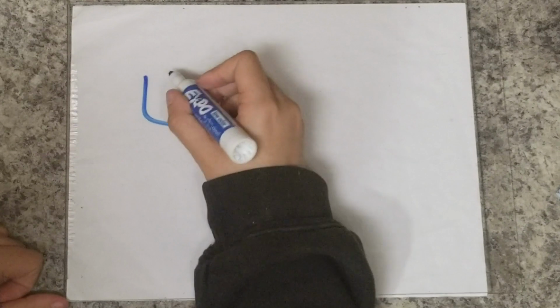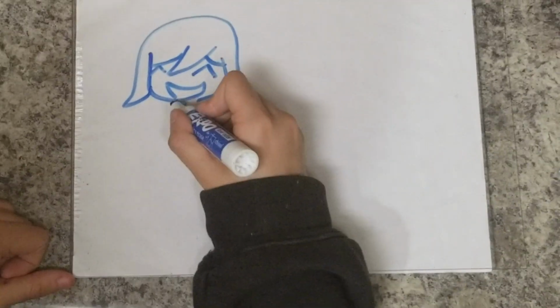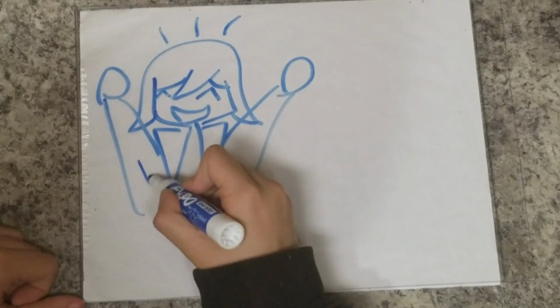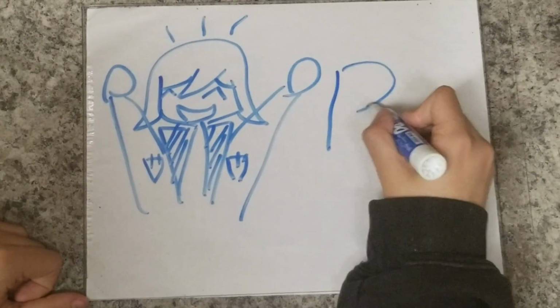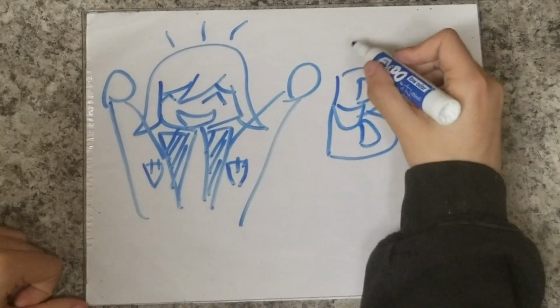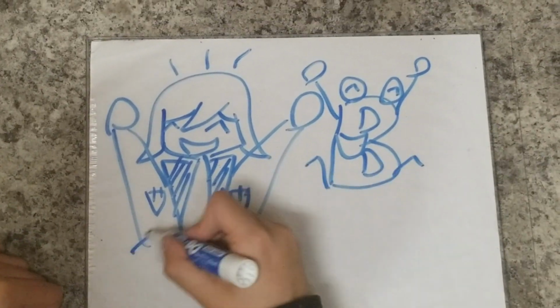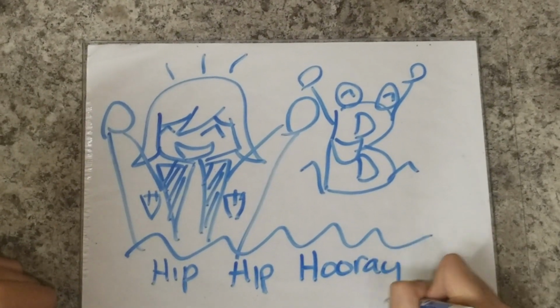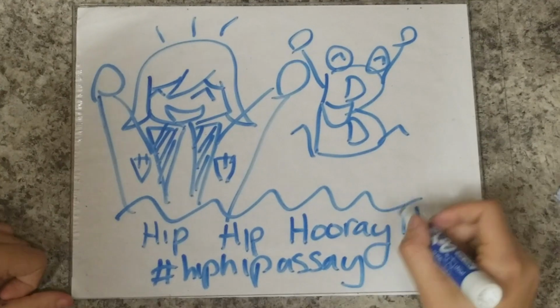A big Bradford party! When Marion McKinley Bradford successfully did this, it was certainly a celebration for her too. And her paper on this procedure is one of the most cited scholarly articles of all time. Hip hip assay! Are you ready to find the concentration of your protein of interest? Now that you're properly prepared, find a good day to do the assay and get on your way. Until next time, have fun learning!